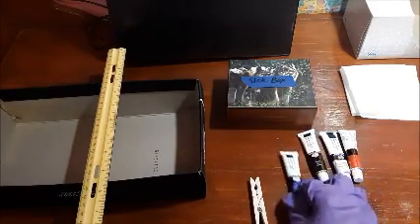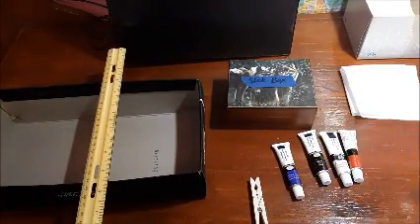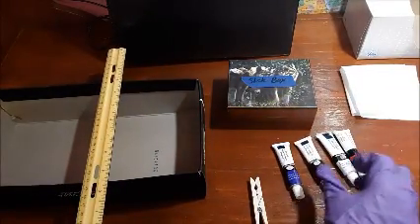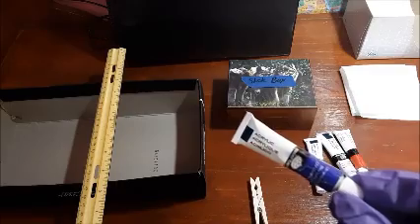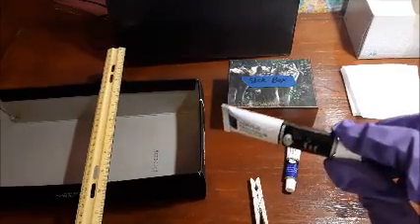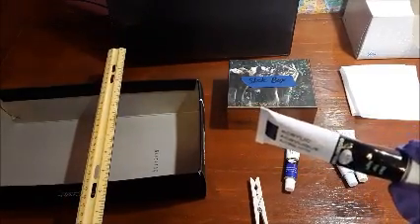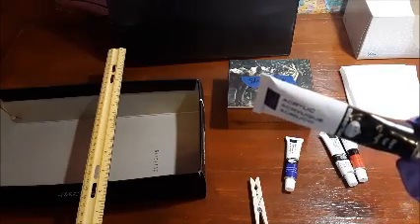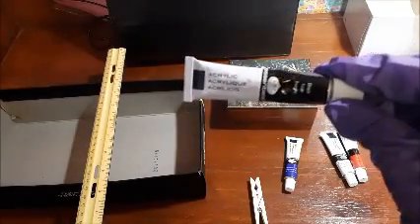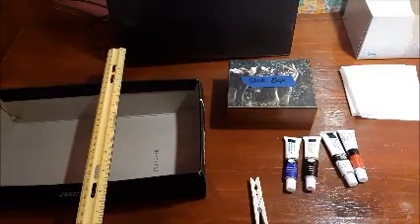Then you would have your crystal violet stain. Yes, I am using paint bottles to make it look like it's those. Gram's iodine stain. Oh, before I forget, the crystal violet stain is going to be your primary stain. The gram's iodine stain will act as your mordant. This will help the bacterial cells in your smear to retain the crystal violet stain better. So that would be those gram-positive bacterial cells that would retain the crystal violet stain much better.